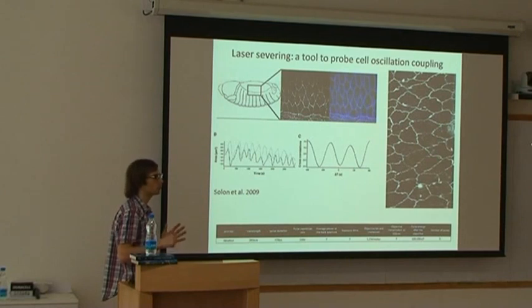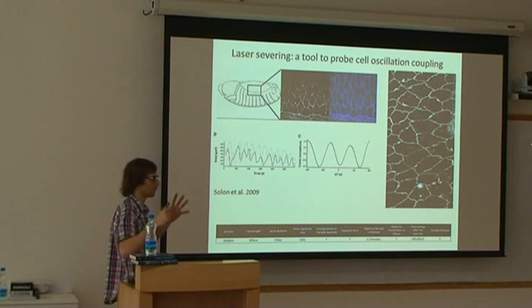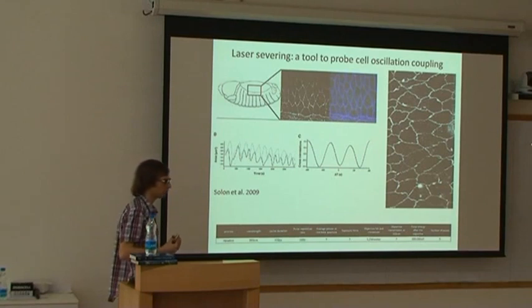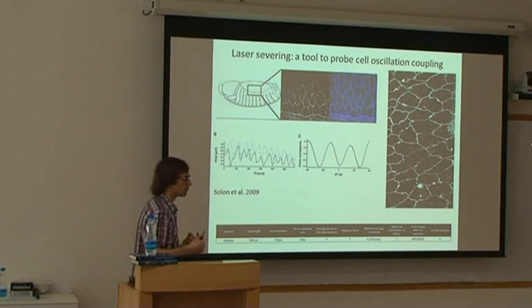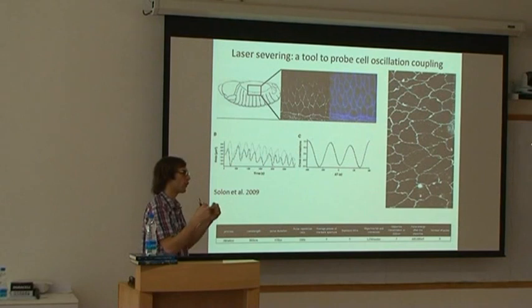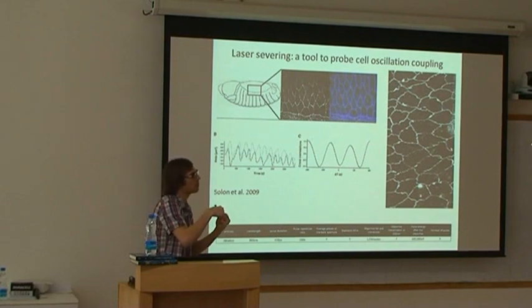The plasma? This will depend on the power you're sending. It could be very big. The plasma itself will go through optical breakdown. That means that the plasma will start to absorb photons and become big. So when you start to create a plasma seed, in the end it's no longer the tissue that will absorb the light, but the plasma itself.